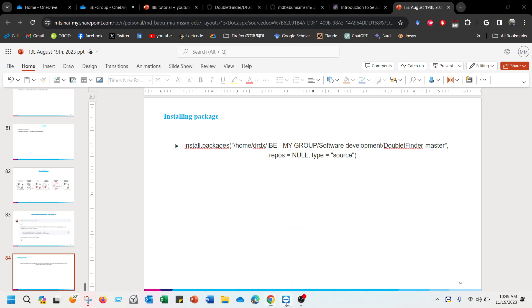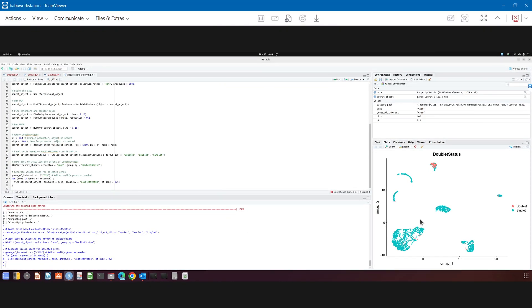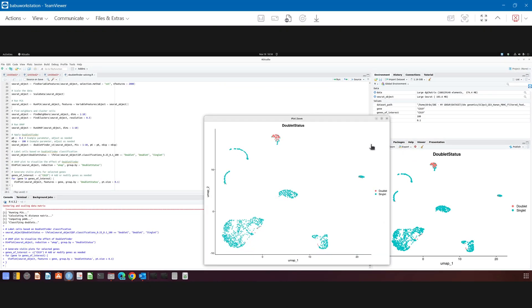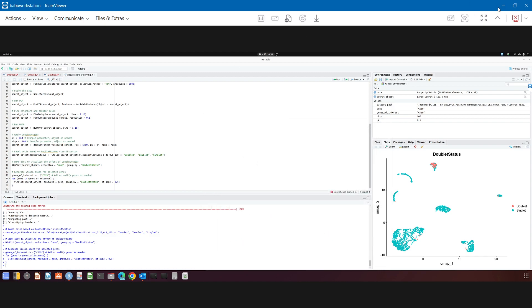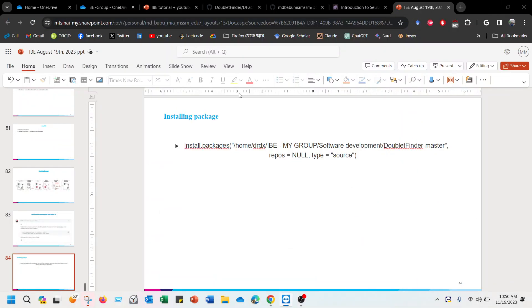And that will be able to identify the doublets and singlets within your sample, and that should resolve the problem. I hope this helps you. If you have any other issues, please let me know. Until then, thank you.